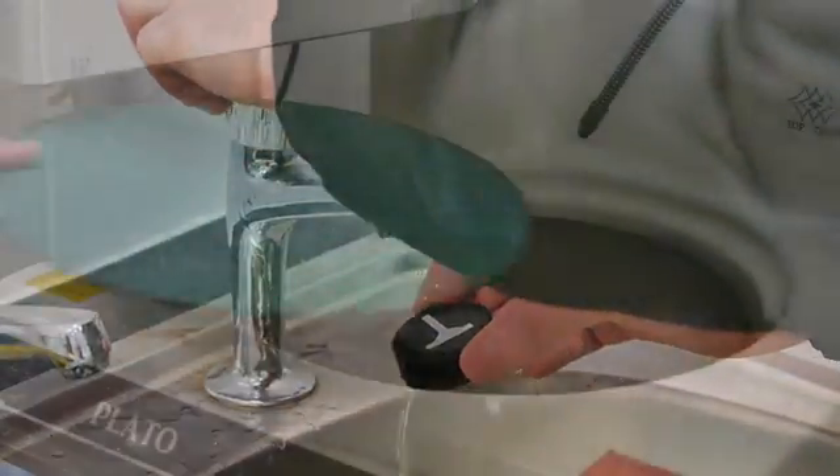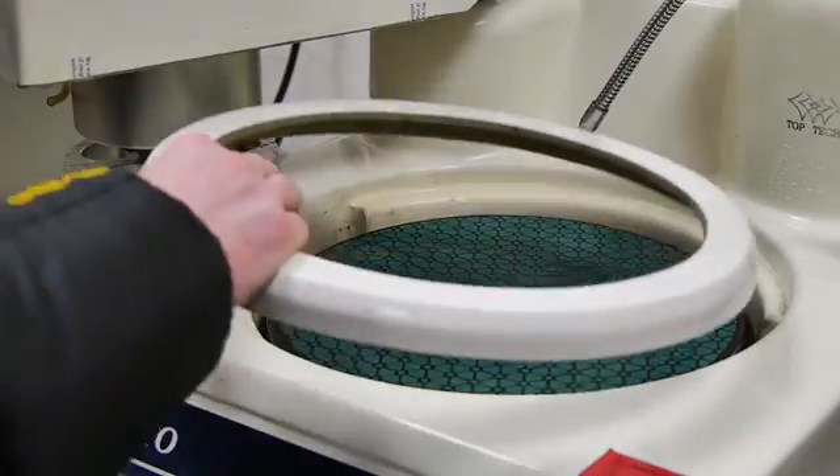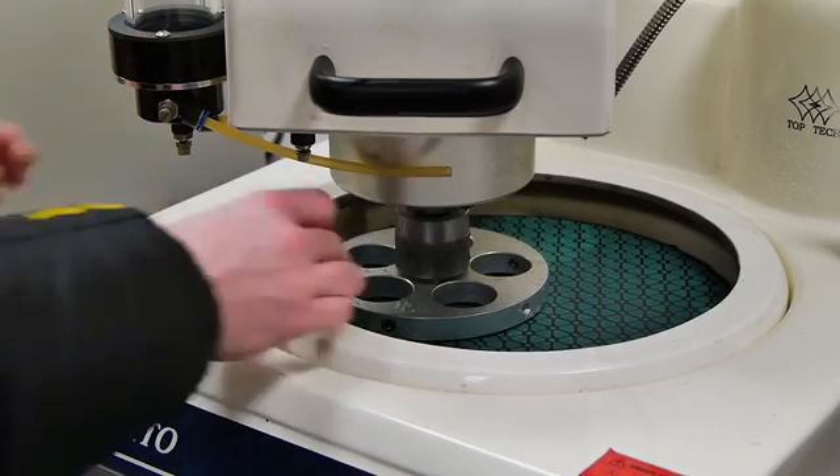The next stage of the route is a Largan 9 disc using Diamax Poly 9 micron diamond. However, other concentrations of diamond are available. At every stage the head must be locked off using the lock on the left hand side of the machine.